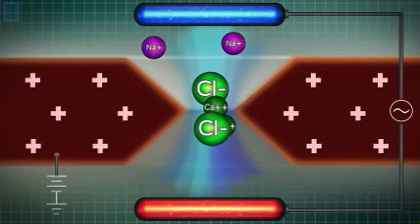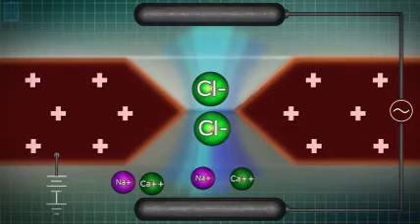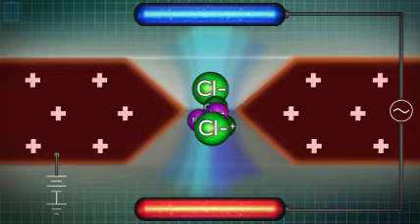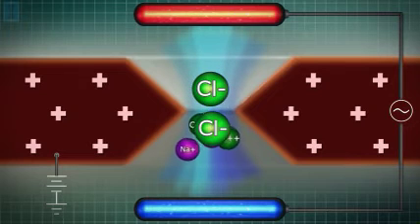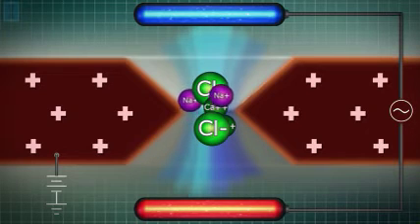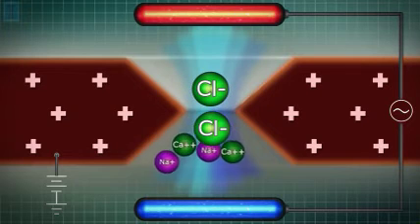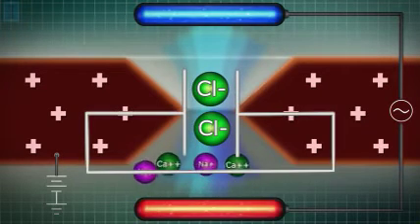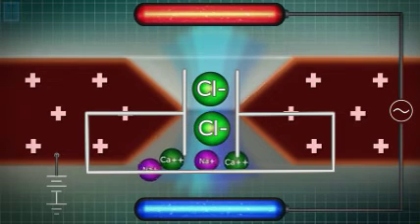This added design latitude was conceived by the Illinois team. Modeled here, this enhancement allows creation of parameters to control the migration of specific entities through the pore. In this way, the properties of the membrane can be changed to trap specific entities within the pore. As is shown here, the chloride ion becomes trapped in the pore and is separated from the calcium 2+ and sodium 1+. Once an entity is trapped within the pore, it is possible to measure the impedance of the pore to understand what nanoentity has been trapped without interference from other elements.